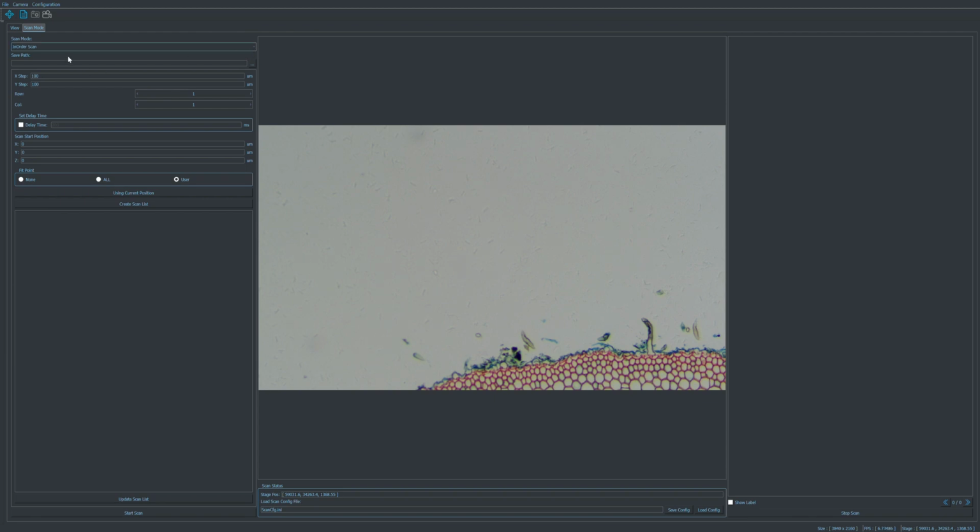So before starting, I will show you three modes here, and I will review one by one. So Stage Pro is basically for scanning a slide or sample which is large and you like to scan fully and put all of the images together. The in-order scan can do the similar job, but you will use it for a known number of tiles you define, and you can also define the moving step size. In the second and the third one, we will have point scan.